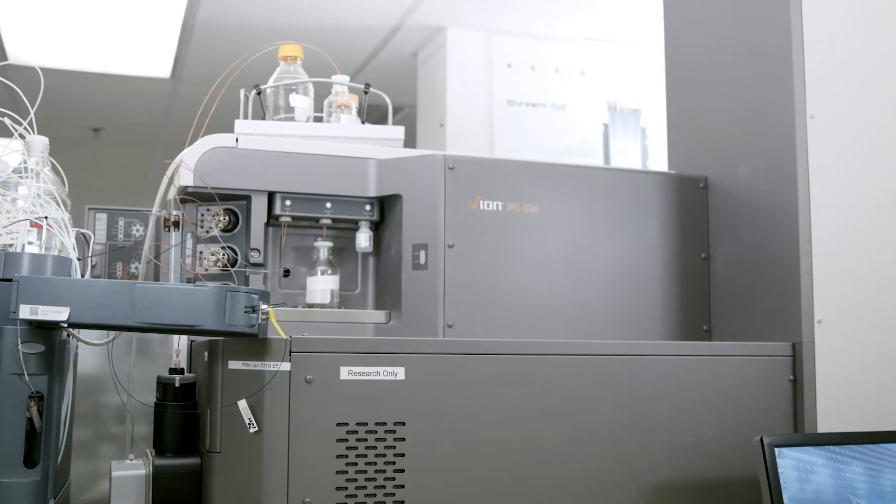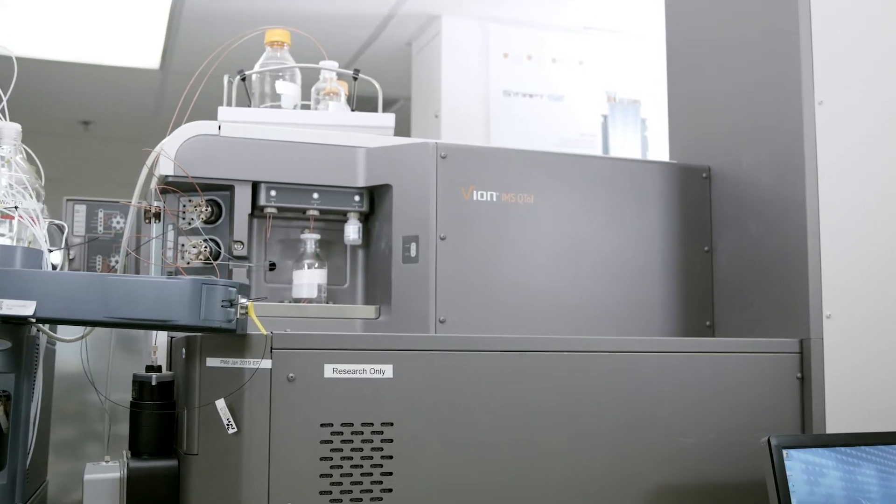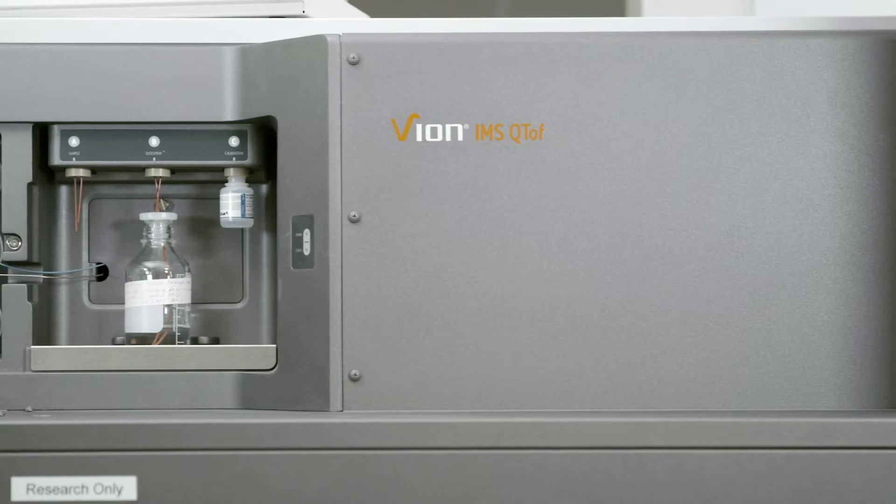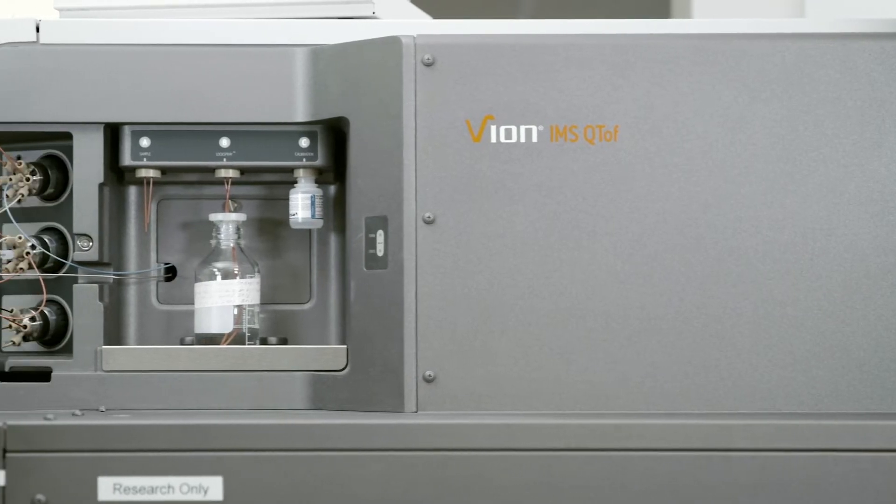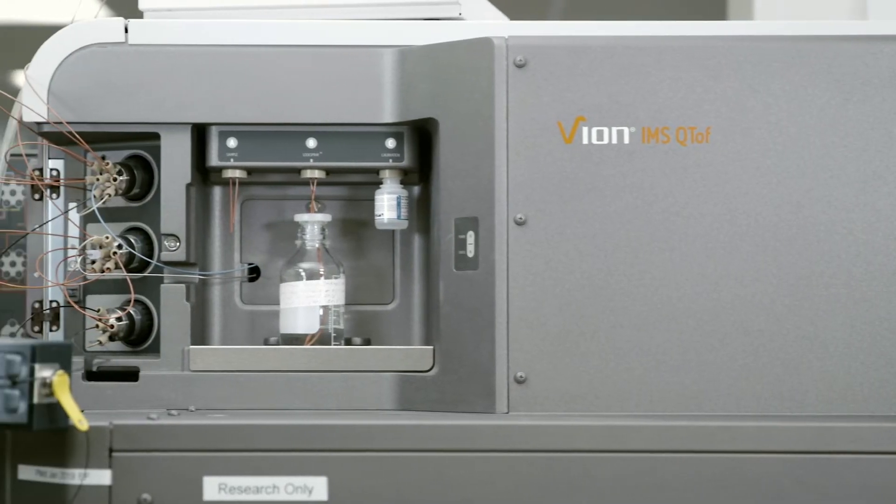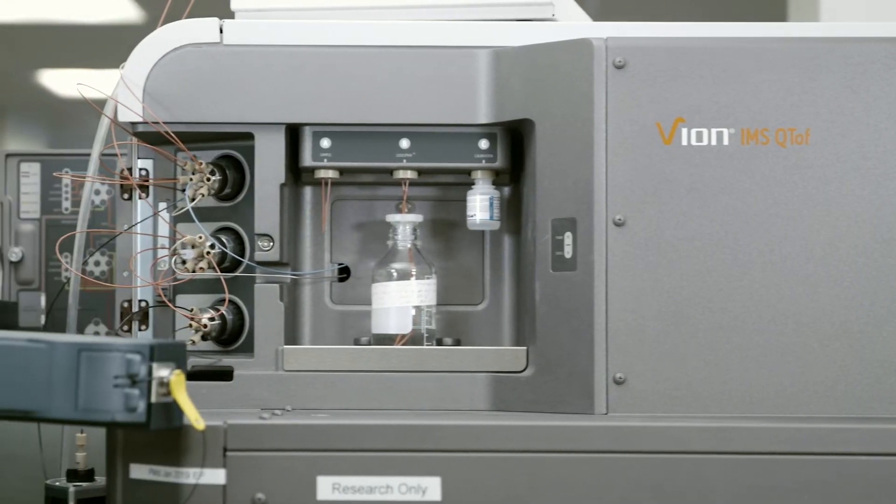All data shown was collected using the Waters Vion IMS QTOF mass spectrometer with integrated ion mobility capabilities.